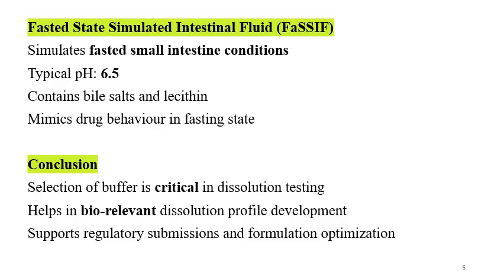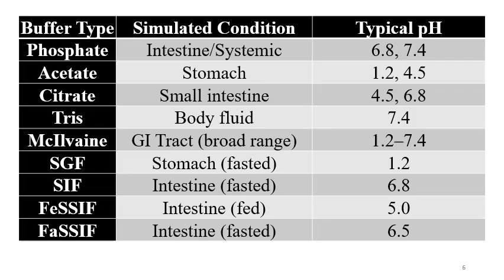In this video, there is a list of buffers which are generally used for dissolution testing. The selection of the buffer is critical in the dissolution testing, and it provides you valuable information and helps in the biorelevant dissolution profile development. It supports regulatory submissions and formulation optimization. The buffer solutions can provide you valuable information for the bioequivalence testing and in vivo behavior of the formulation.